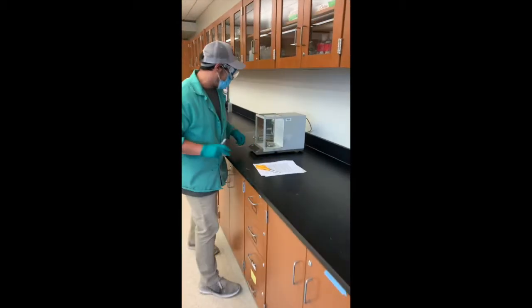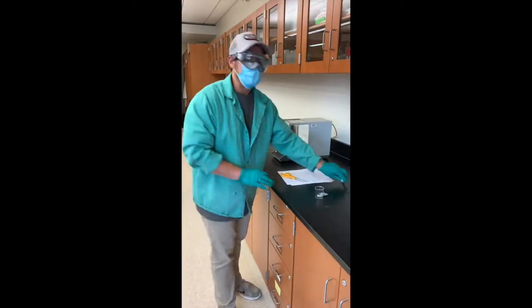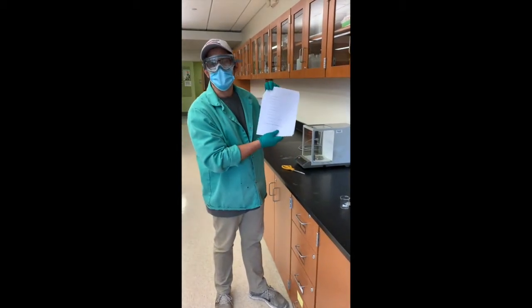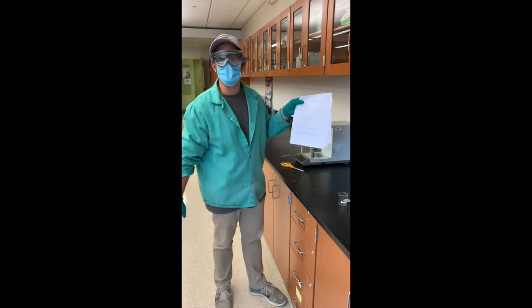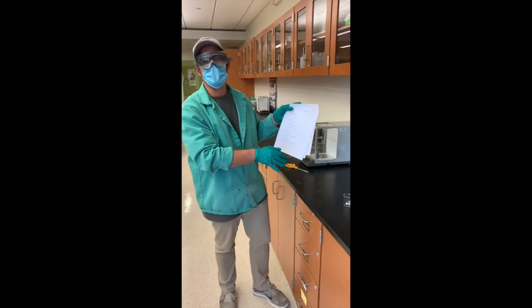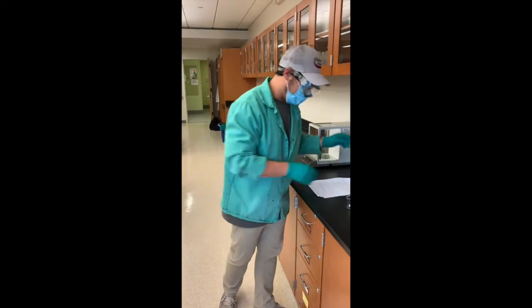So the next step is on the analytical balance. You're going to pre-mass a 50 milliliter beaker. Make sure to put the weight of the beaker into your results section, as the second entry there, the mass of the beaker. And this is on page 5. It is crucial that you start taking this information, because in order to calculate theoretical yields, we're going to have to keep track of this info.